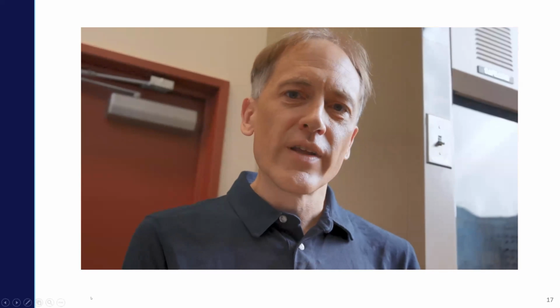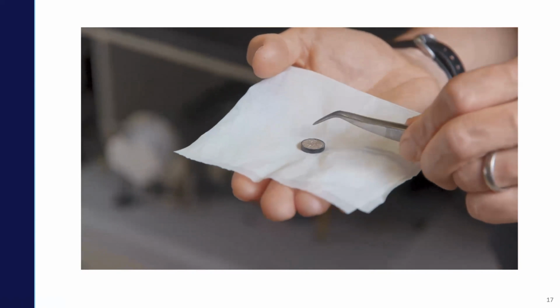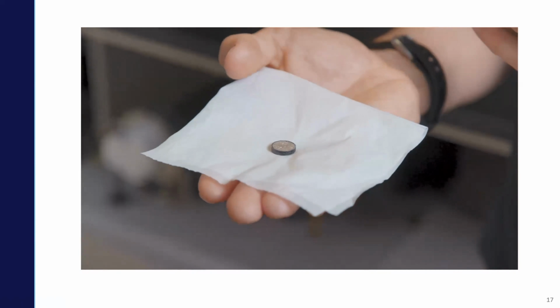Finally, I want to mention that there's really a minimal amount of sample prep involved. We grew this plant in a rhizobox. To do the sampling, we took the side off the rhizobox.